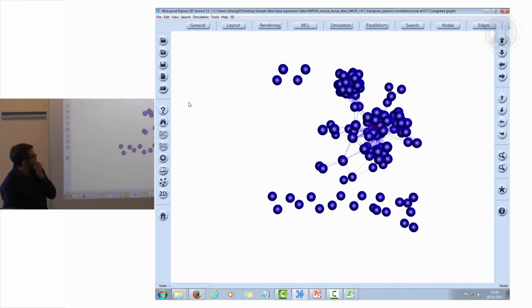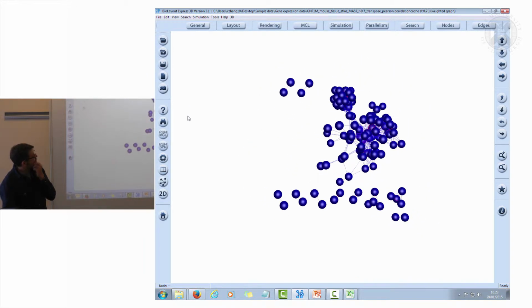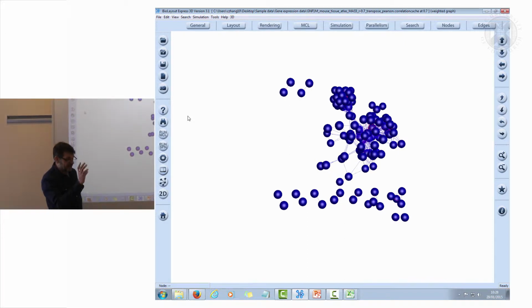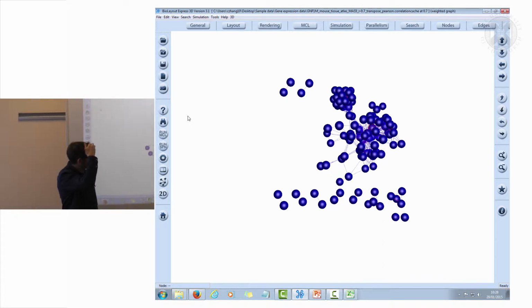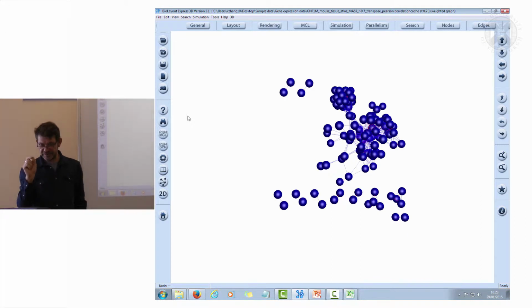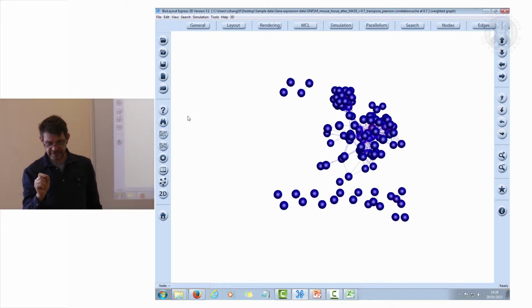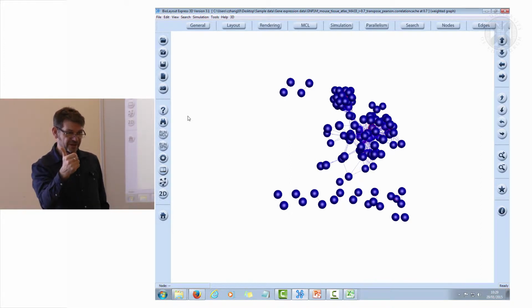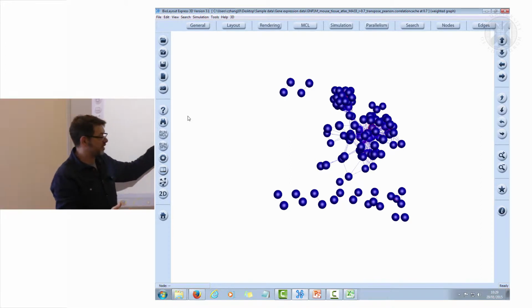This graph is still a very small graph, but you can see already it's getting structure, it's getting complexity in how things are grouping. In this case, each node in the graph represents a different sample that we put in. So 61 different tissues in replicates. Each one is essentially a tissue.